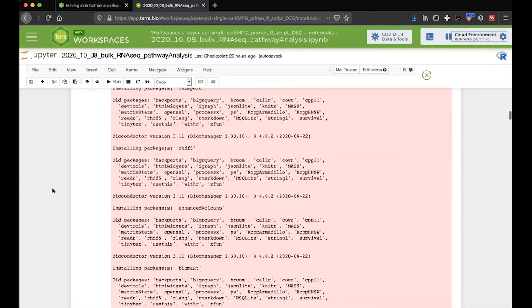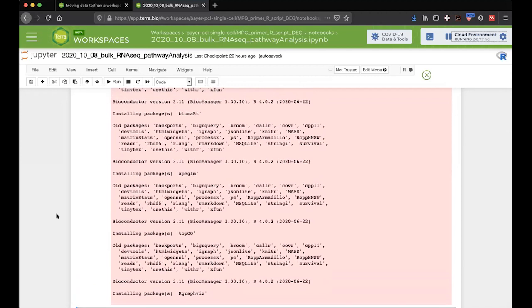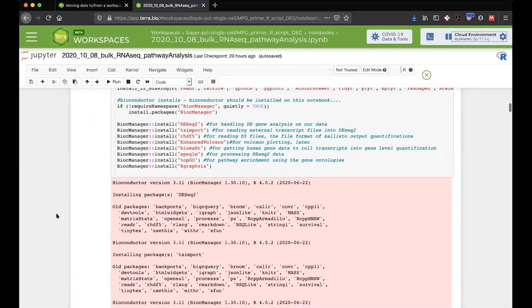Okay, so it sounds like I'm hoping that everyone is getting through these initial steps okay. Always a little bit like, oh, is it going to take 5 minutes or 6 minutes? But we're probably all hitting Terra at the same time. I did warn them.